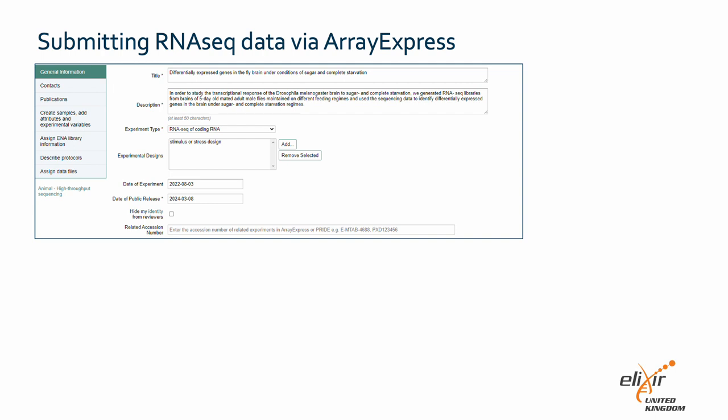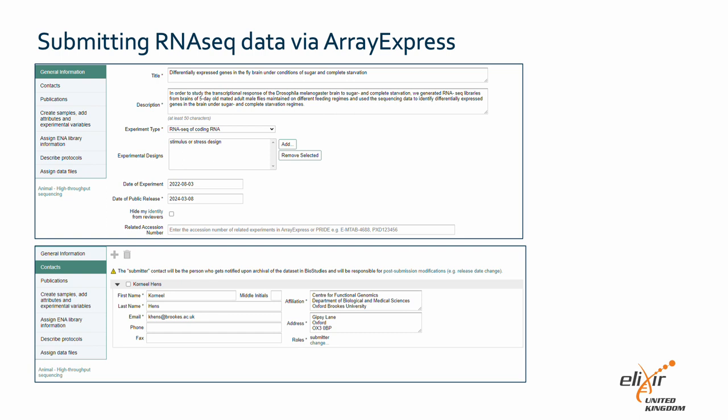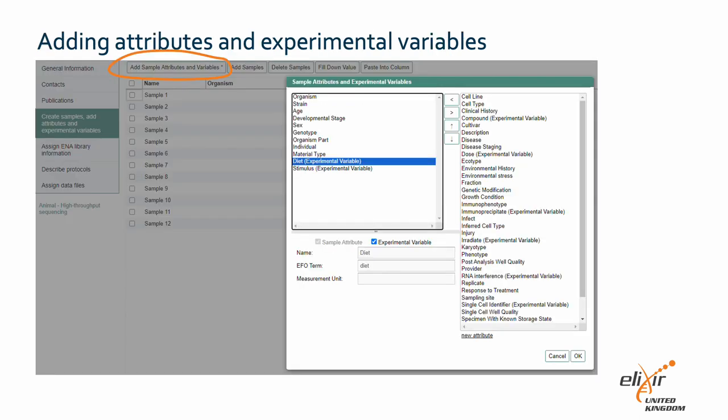You now end up with a form with different tabs that all need to be completed. Under 'General Information,' provide a title, a description, the experiment type, design, the date of the experiment, and date of release if you want to embargo the data before publication. Under 'Contacts,' complete your contact information. The next tab allows you to add attributes and experimental variables to your samples. To do this, click 'Add sample attributes.' This will bring up a window that allows you to add or remove attributes relevant for your samples. Be as complete as possible — for example, we will add diet as an experimental variable.